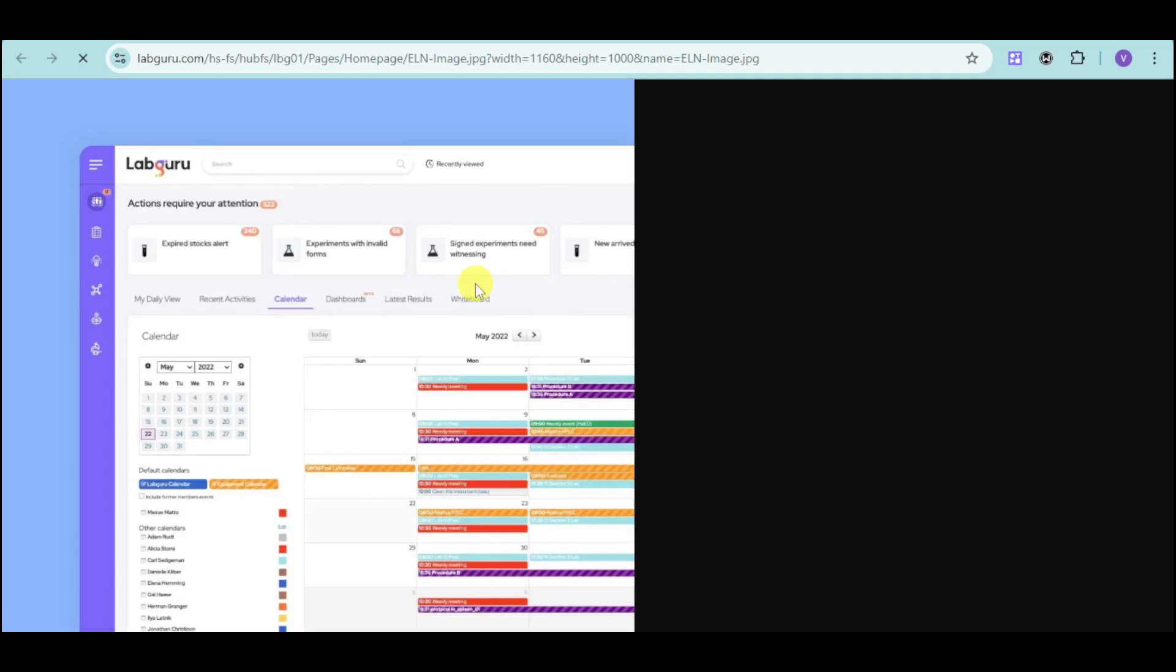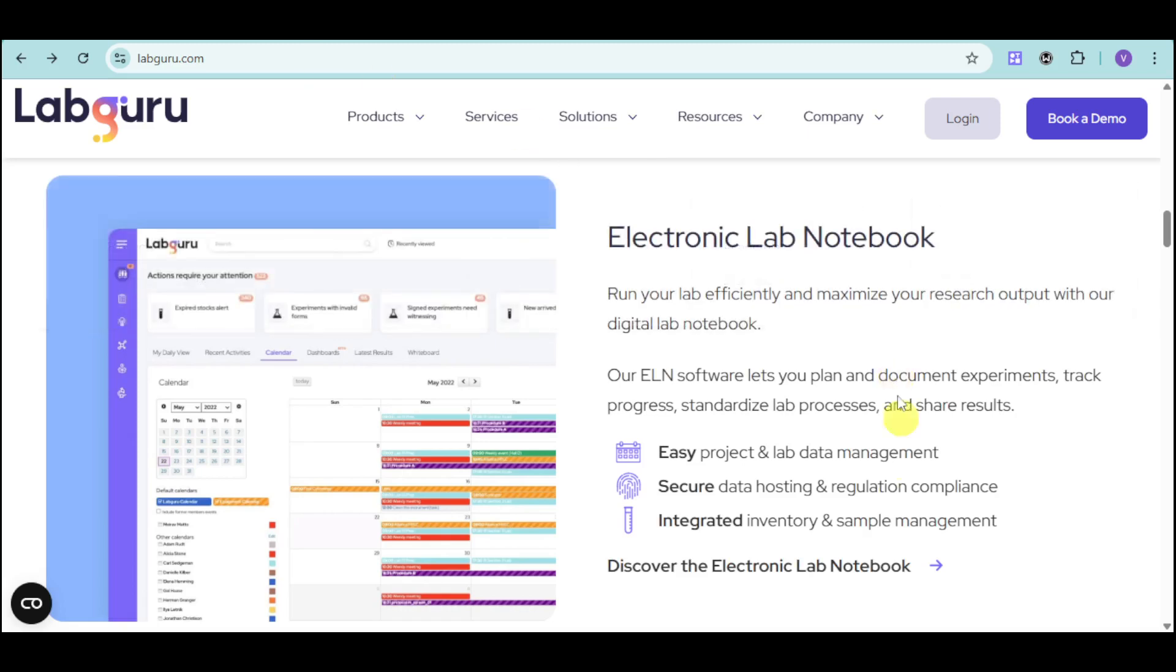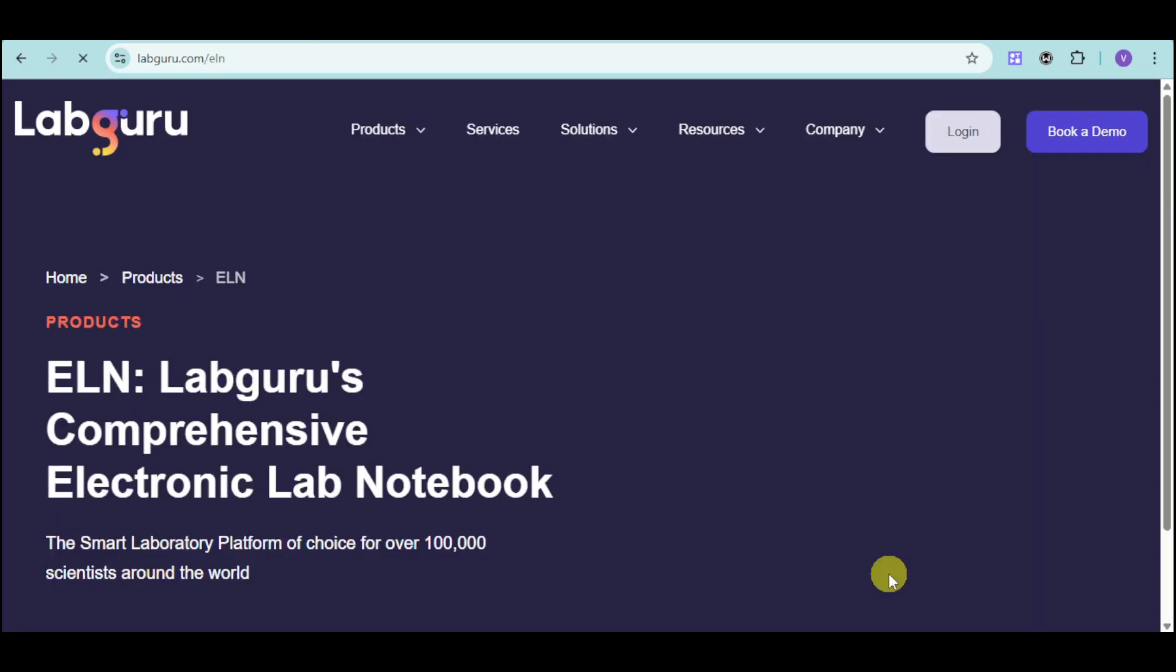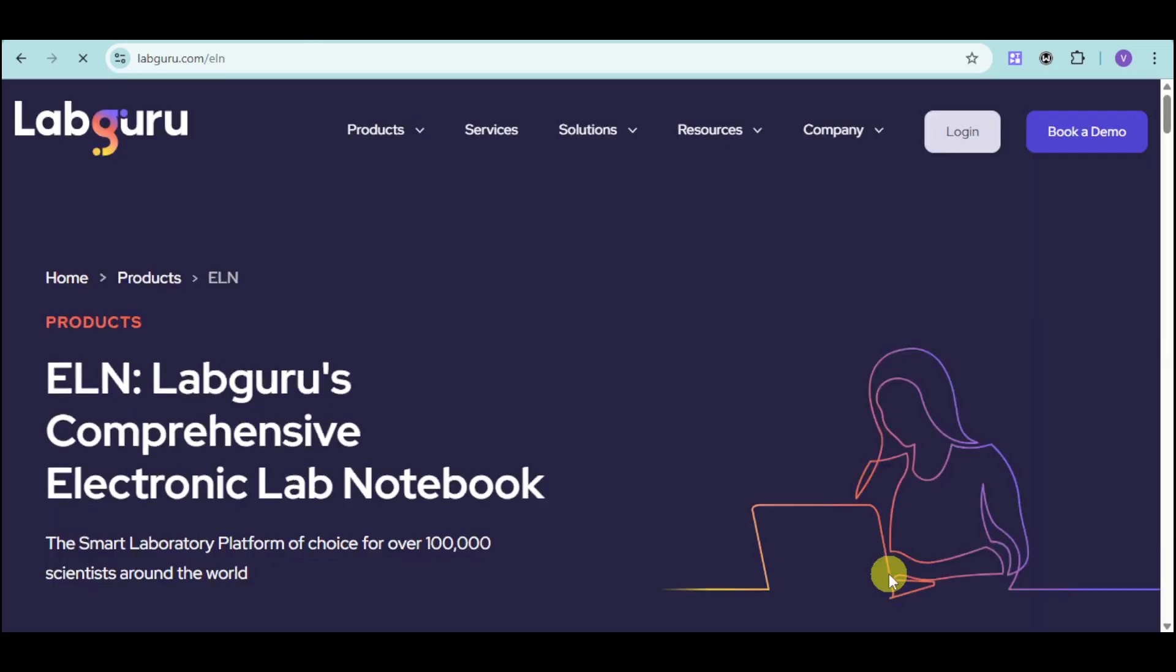Here it is right here. You can see that we have the actions required, the calendar, experiments with invalid forms, signed experiments needing witnessing, as well as a lot more. Let's dive further with their ELN.